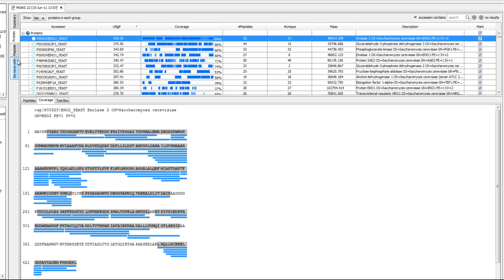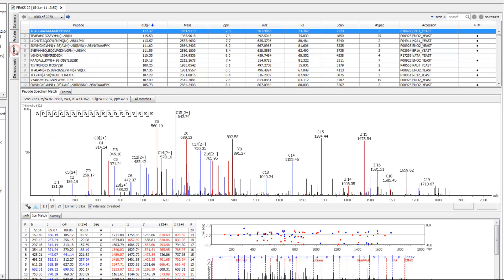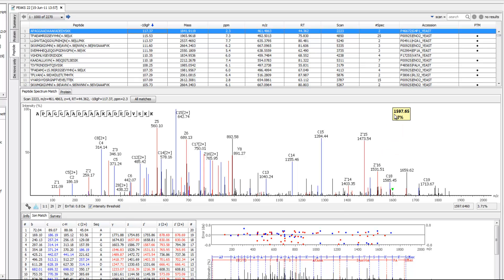To take a closer look at the peptides confidently identified from the sequence database, we select the peptide tab from the left. Reported here are each peptide's minus-10 logp score, annotated spectrum match, ion table, and error map. PEAKS also provides very user-friendly ways for you to examine an individual peptide that has been identified.